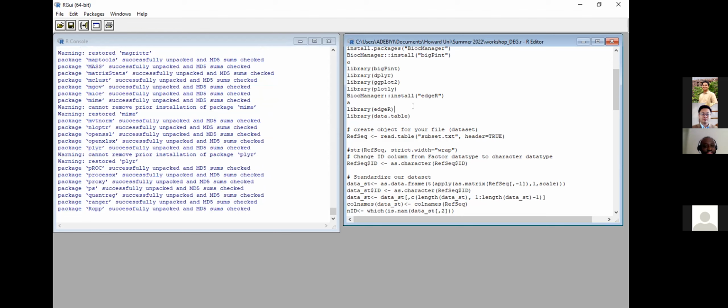All right. So I guess this is also bringing everything in there. I think it's almost done. Then we get to the file.